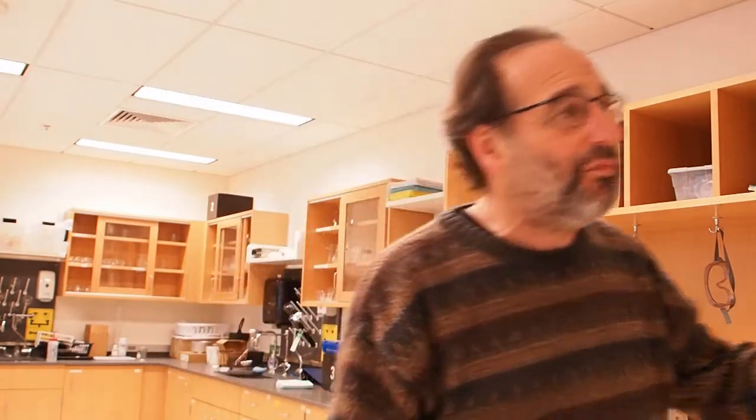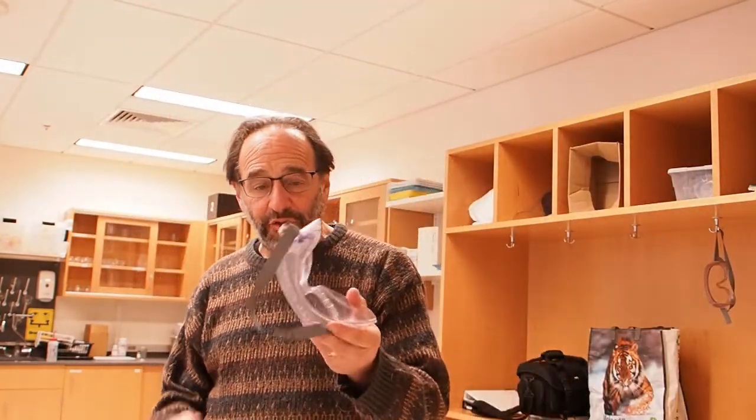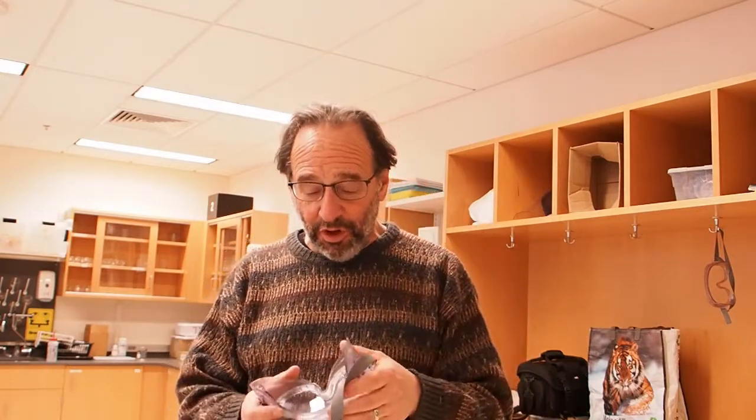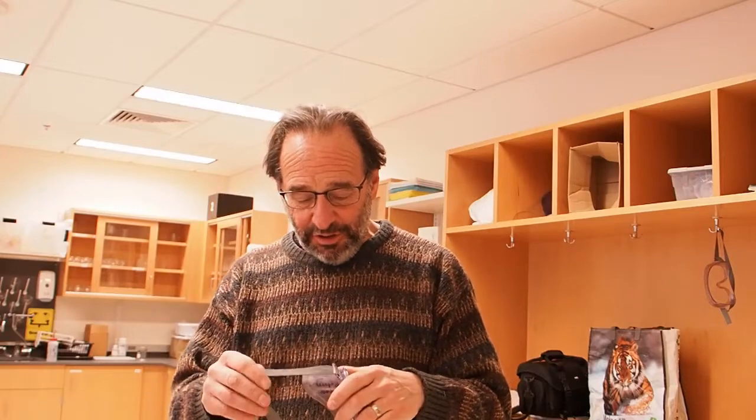The most important thing to keep chemicals off you is those things that keep chemicals out of your eyes. Your eyes are the most sensitive and dangerous place of attack for hazardous chemicals. And for that we have safety goggles. And so these safety goggles are not the same thing as safety glasses you would get at like a Home Depot or a Lowe's that keep a nail from hitting your eyes.